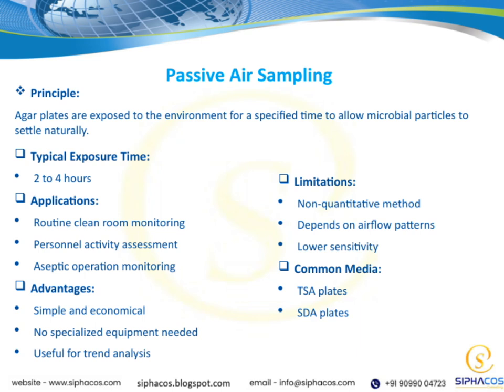This method is often used in routine clean room monitoring, helping us ensure that environments stay within cleanliness standards. It's also useful for assessing personnel activity, seeing how human movement might influence microbial levels, and for monitoring aseptic operations, ensuring sterile conditions are maintained. One of the key advantages is that it's simple and economical.